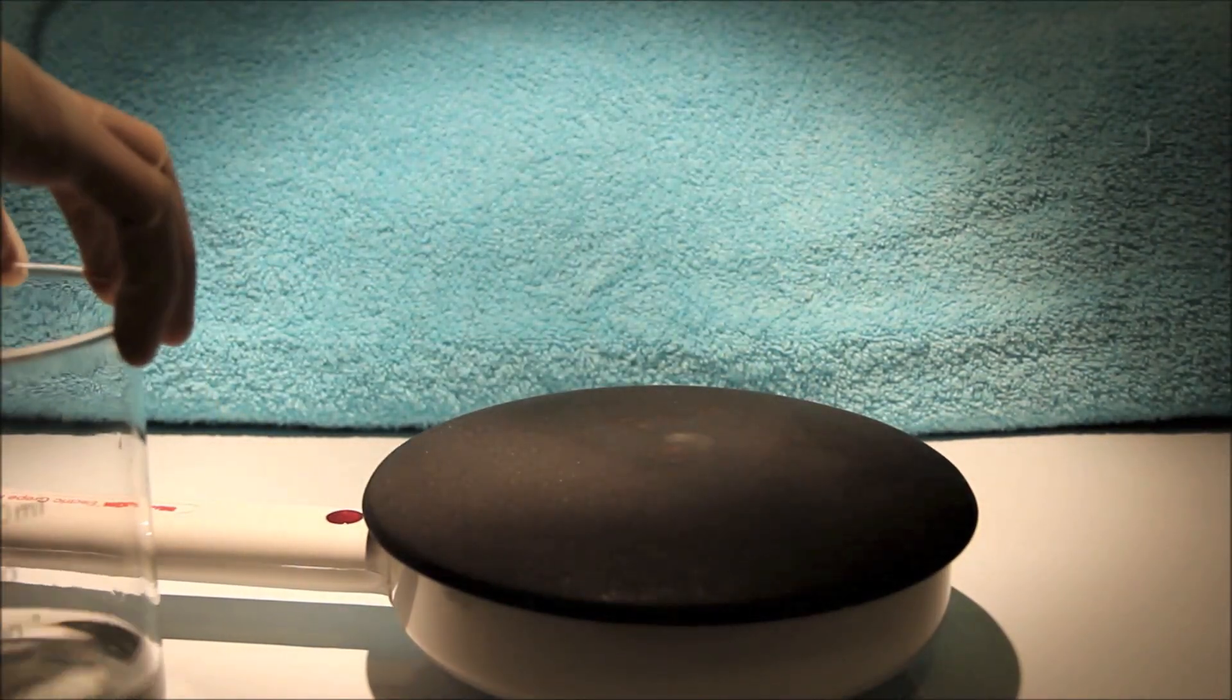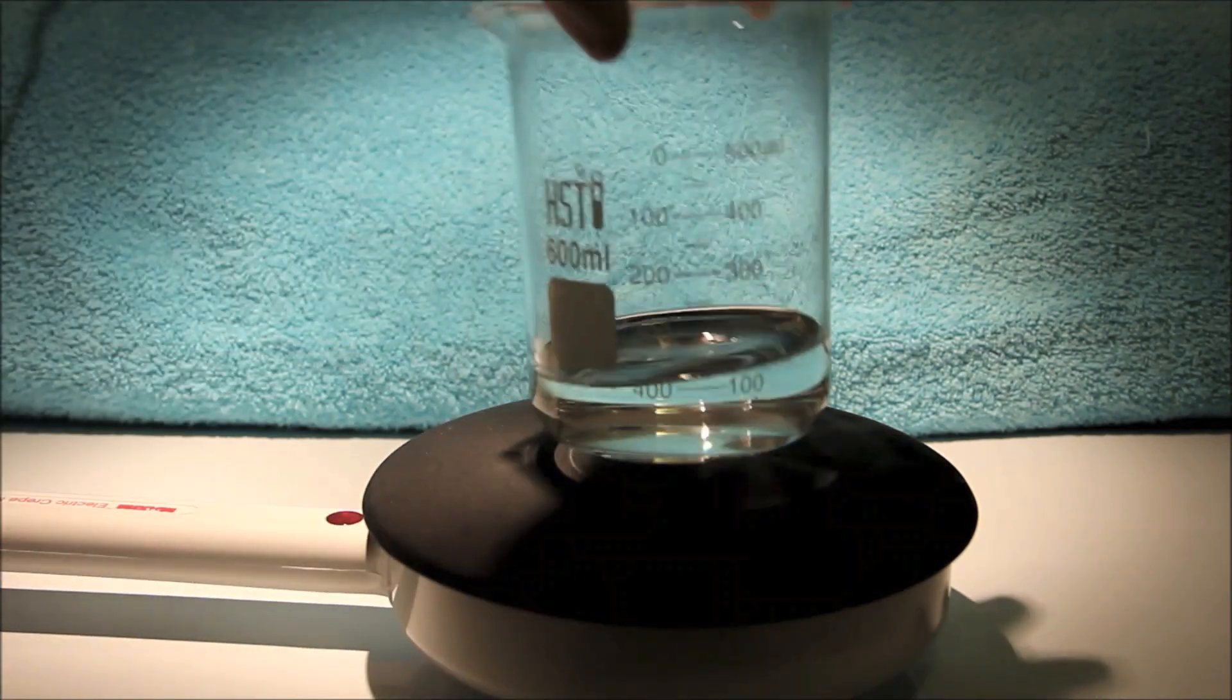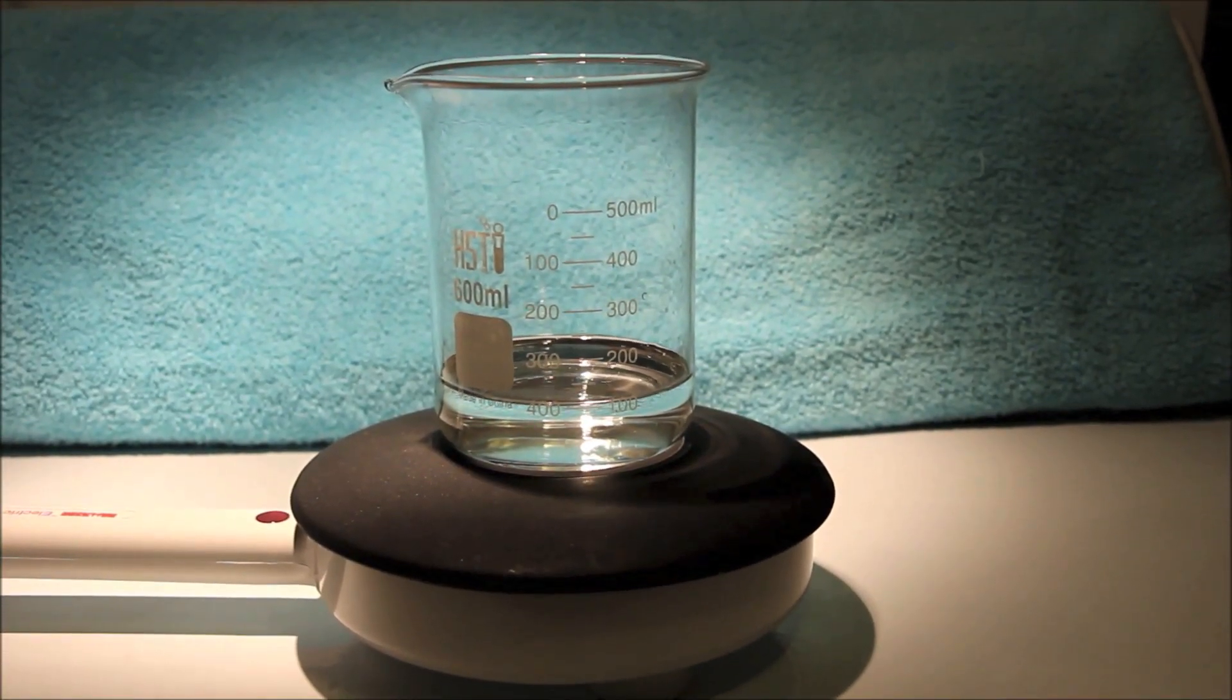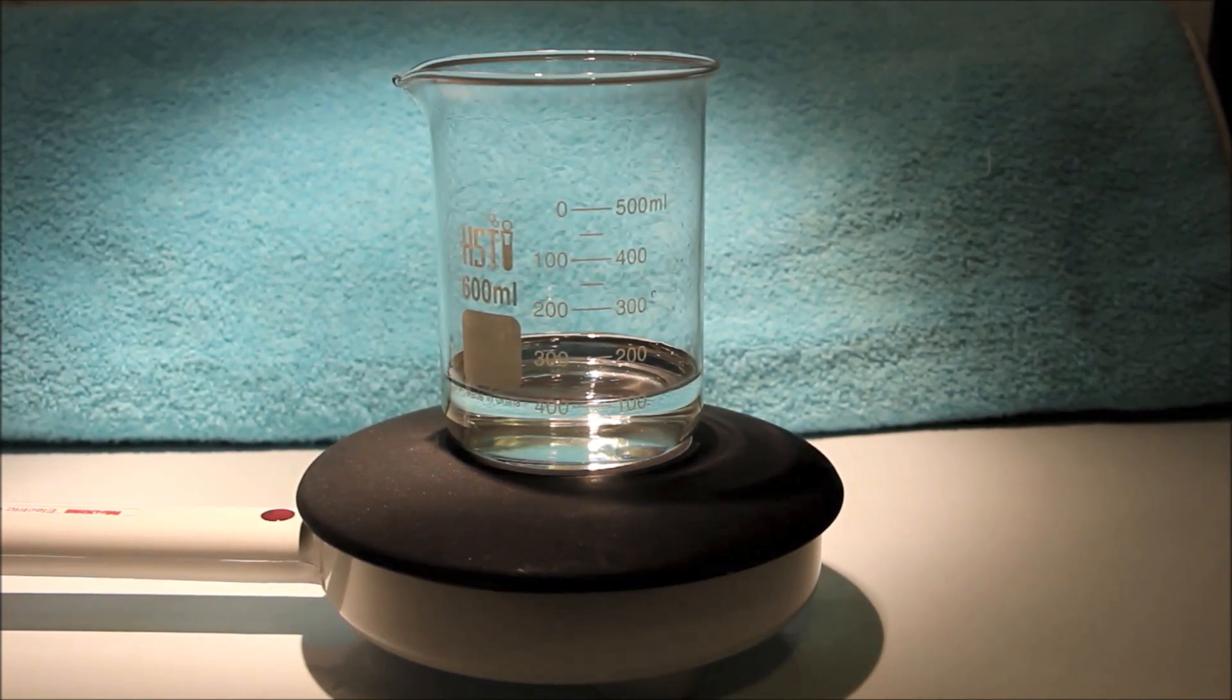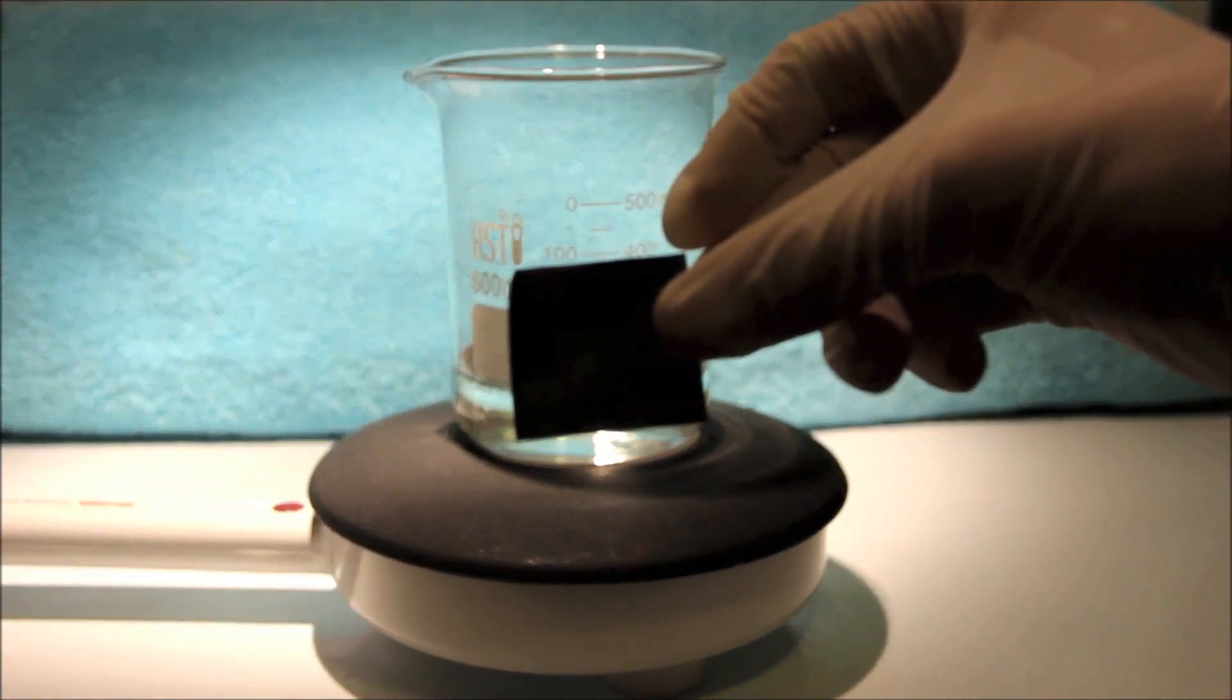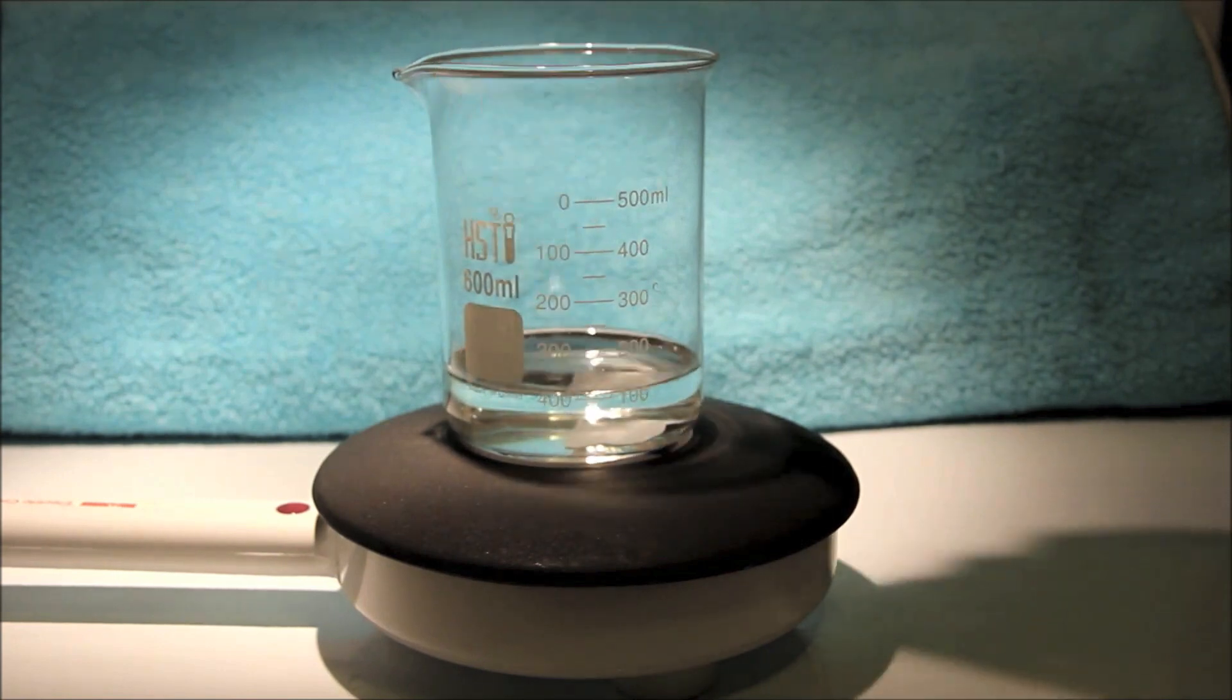And here I have a hot plate. Any suitable source of heat will do, as long as it gets the water to a boil. I'm going to place the beaker on the hot plate. Here I have a strip of zinc metal obtained from the inside of a lantern battery, following Nerd Rage's tutorial. I'll simply add the piece of zinc metal to the solution.